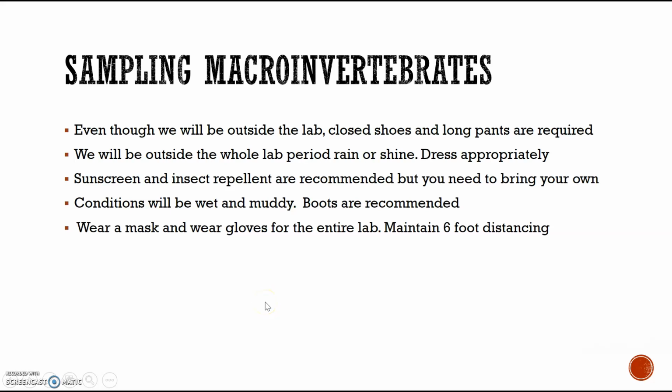We're going to be outside the whole lab, rain or shine, so dress appropriately. Make sure you wear closed shoes and long pants. Sunscreen and insect repellent are recommended, but you need to bring your own. It's going to be wet and muddy, especially for the folks that are going to be taking samples down by the edge of the pond. If you've got rubber boots, they are recommended. You're going to be wearing a mask and gloves for the entire lab, and we're going to maintain our 6-foot distancing.